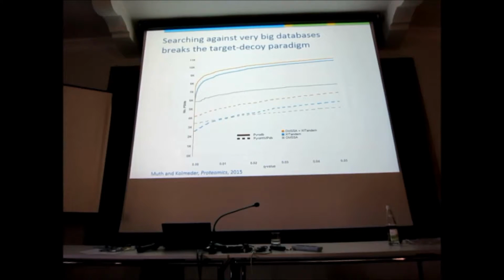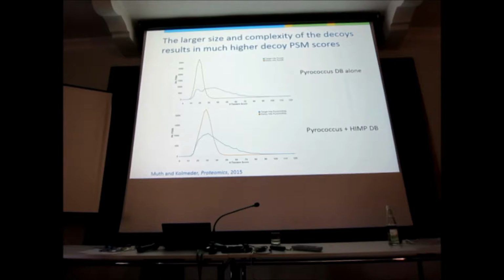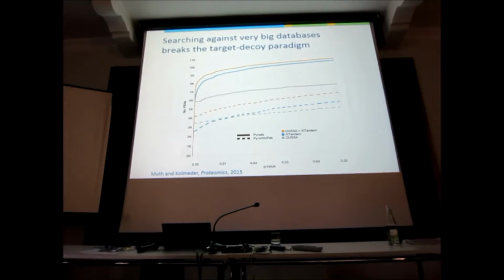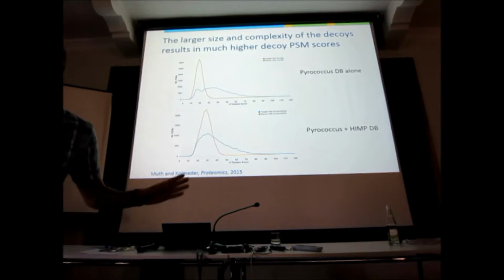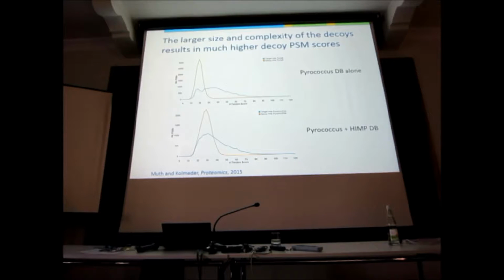So people come up with a way to fix that. And the first thing I have to tell you is why do we lose all of these identifications? It's very simple. I have plotted the distribution of the decoy scores, these are in orange, and the normal Pyrococcus scores in blue. What do you see? The decoys all have low scores, and the Pyrococcus have both low scores and high scores. And the FDR mechanism is you put a line here-ish, where all the stuff on the right has 1% orange compared to the blue. That's 1% FDR in the stupid way, okay?